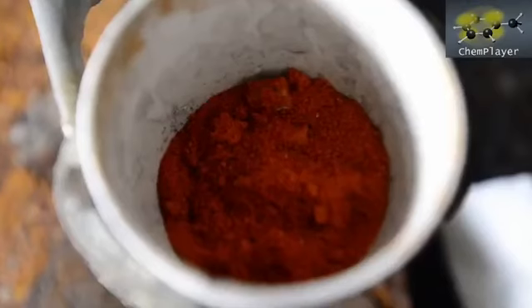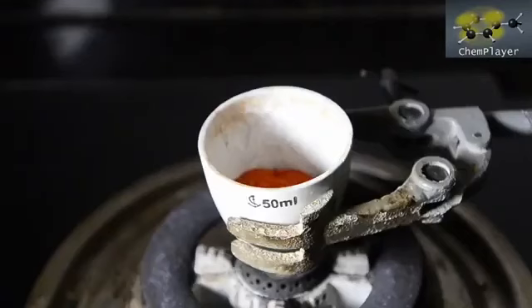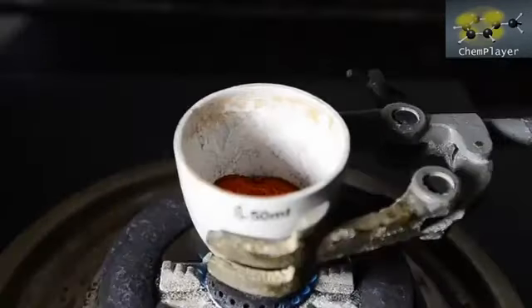Okay, here we go. We'll use a burner and first heat this up to a low temperature, but enough to melt the sodium metal. Then we'll mix this into the powdered ferrocyanide thoroughly.